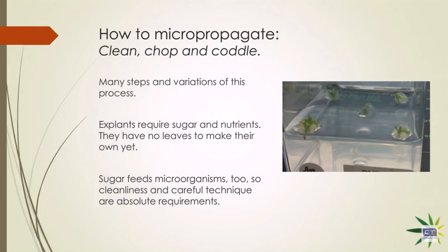The method that I've implemented in this particular figure, you see those growing tips, they look like they're in some sort of a bead of their own, and so they are. This was a two-step process. The gel material that fills most of the culture container is gellan or gelrite. It's a seaweed-based growing medium common in microbiology and in plant tissue culture. But the growing tips were encapsulated in a separate process in a related material called alginate, which sets up differently. You don't melt it. You use chemistry to get them to set up.